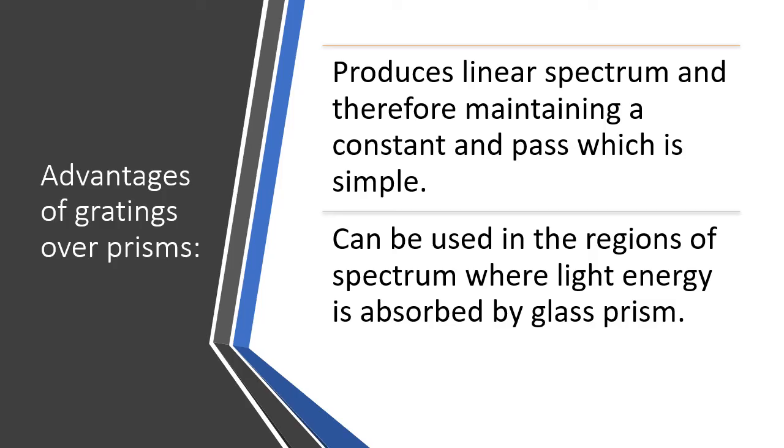Advantages of using gratings over prisms. And like I mentioned earlier, it's a lot better. Our gratings are a lot better than prisms. Kasi yung mga prisms natin, it's a bit primitive. Okay?